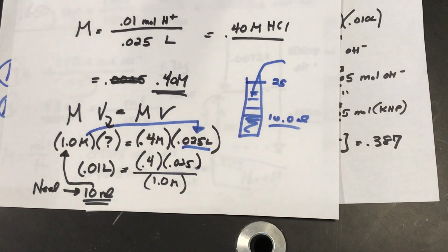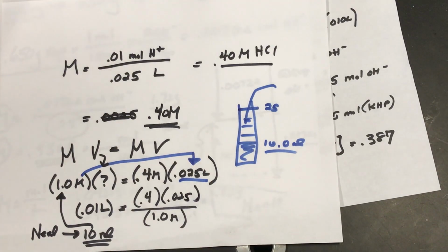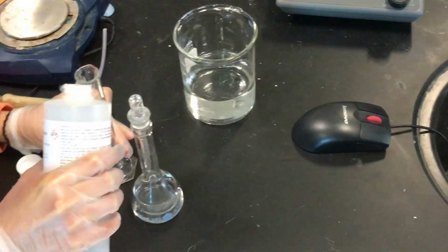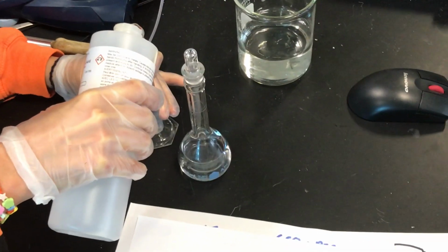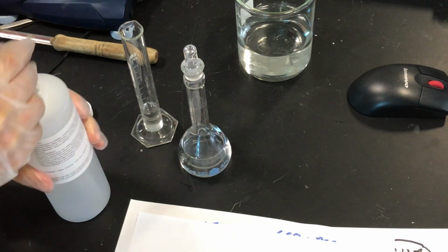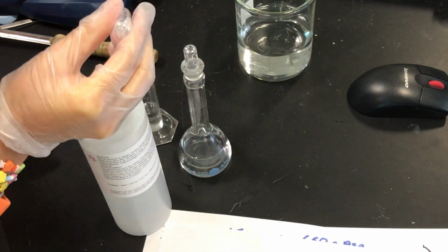So you guys are going to do that now. So here's your 1 molar. We have our gloves on and our goggles on. We're going to use this graduated cylinder here. It's got a 10 mil mark. You can add by pipette, and that's all we're doing, very carefully. Again, the accuracy of this lab. Oh, she's a good pourer. Get a little below the 10 and now use the pipette. Get to eye level to get that meniscus right on that 10.0 mark.